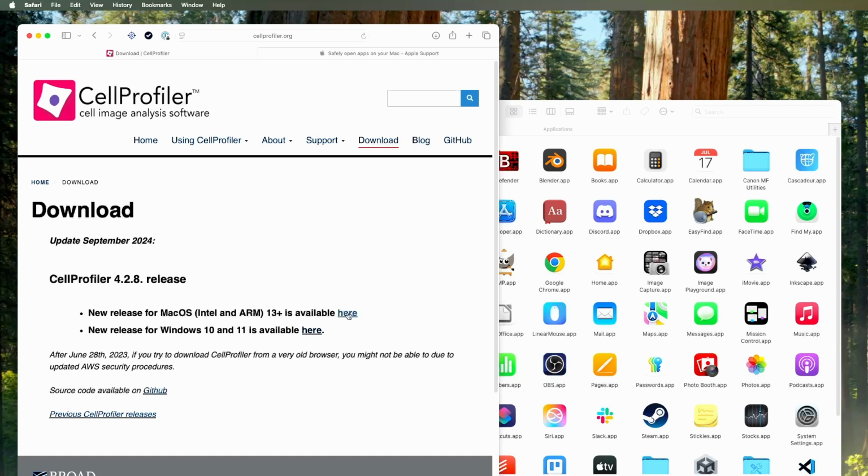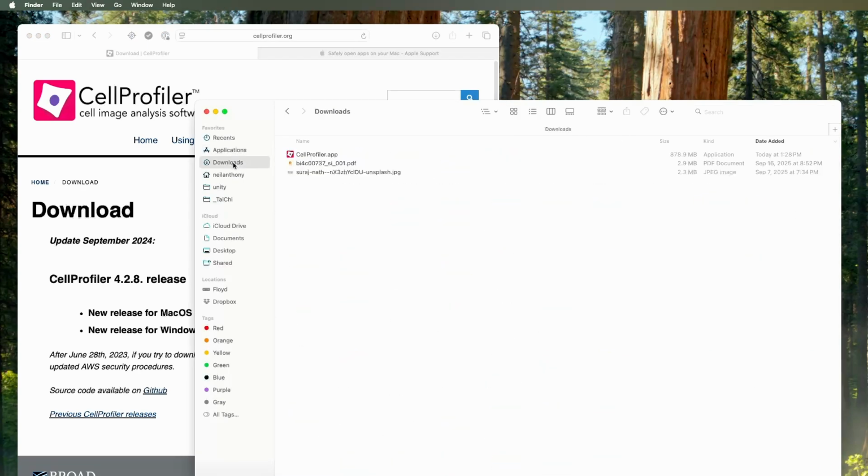And so if we go ahead and download that one there, it'll be with us in just a moment. And so there is going to be an issue as you open it up because it's not registered with Apple in the App Store, and it will warn you about it being potentially malware, or not knowing what's in there. And so let's go to our downloads, have a look.